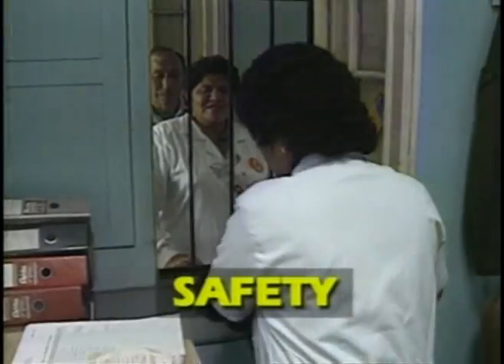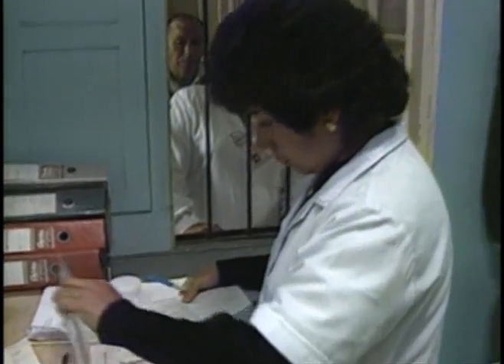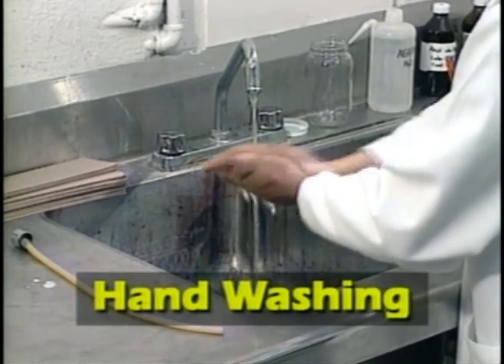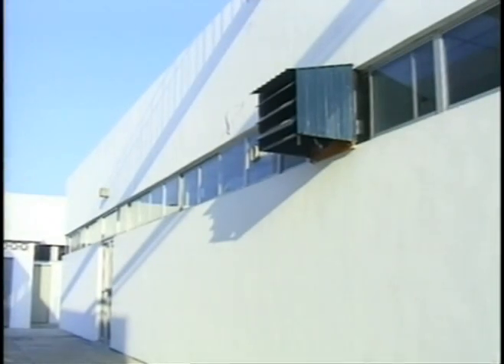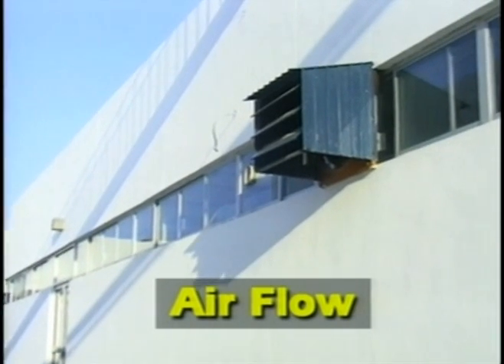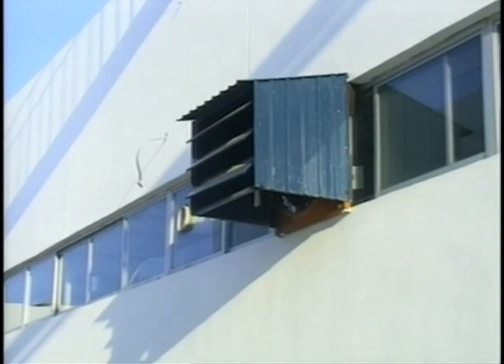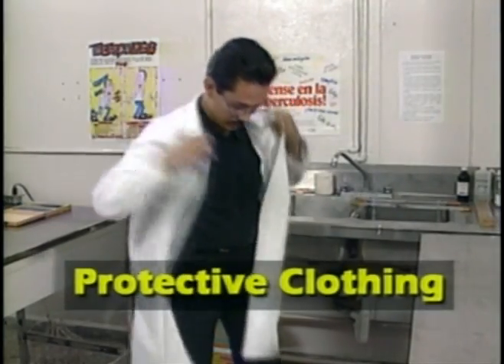Strict adherence to safety regulations in the laboratory is crucial. Safe practices include washing hands frequently and always before and after performing any procedures, establishing airflow in working areas that will carry infectious particles away from lab personnel. This air should be exhausted into a remote location. Strictly refraining from smoking and eating in the lab. Wearing protective clothing and use of protective equipment.